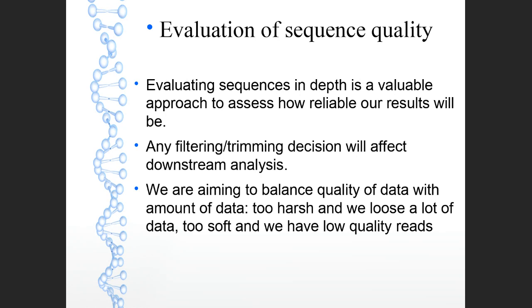And being bioinformatics, we can always go through this step, see what we get out in the end, and then repeat with different parameters and see how that affects our data. So we might have to go through this process that I'm about to describe several times in a real experiment to assess what gives us the best results.